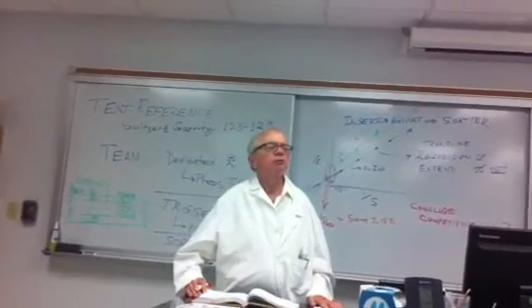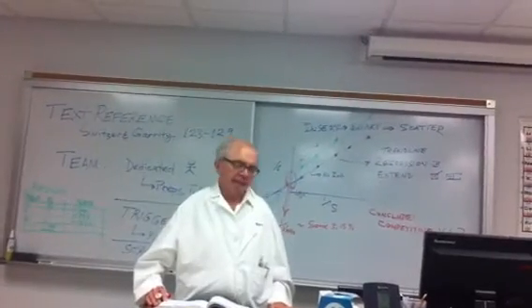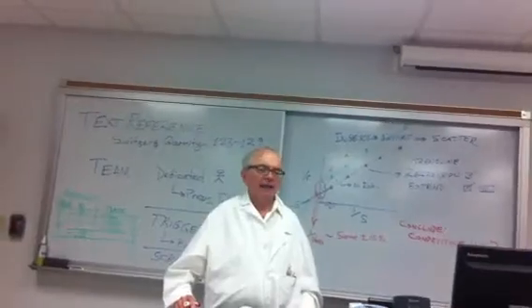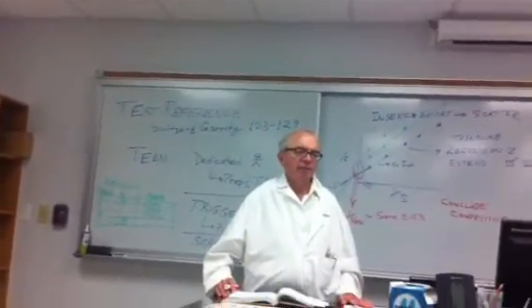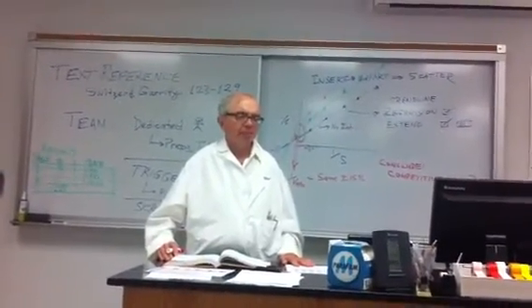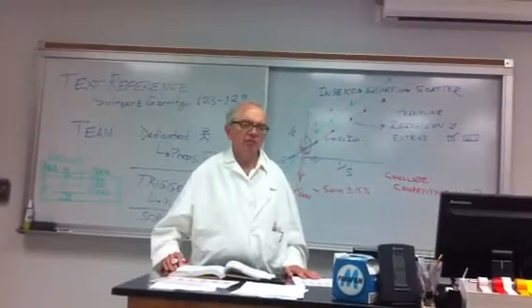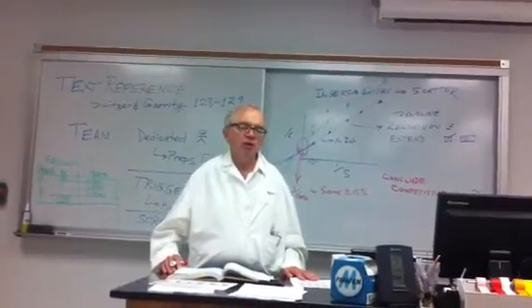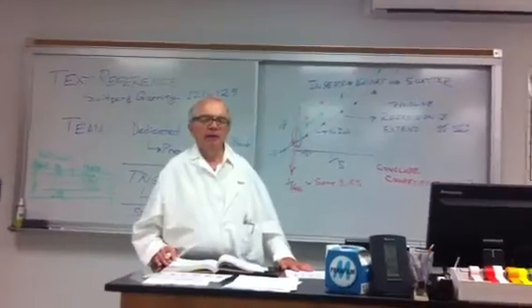Great, now the first thing I want you to do is to practice all of this by running the blank. Okay, so the first thing you need to do is run the blank. The blank should contain everything except what? Enzyme. It contains no enzyme. It contains substrate. It contains buffer. And instead of enzyme, you just add water. That's all you do. Okay?